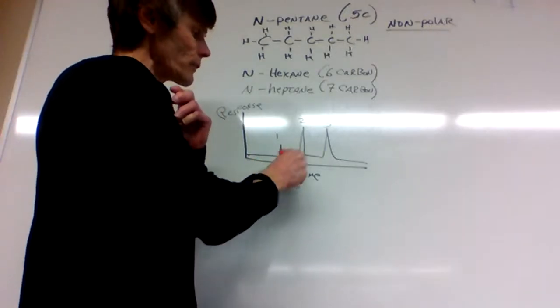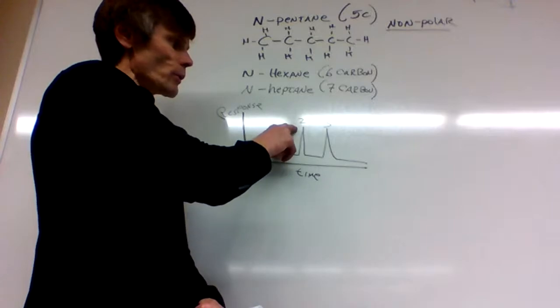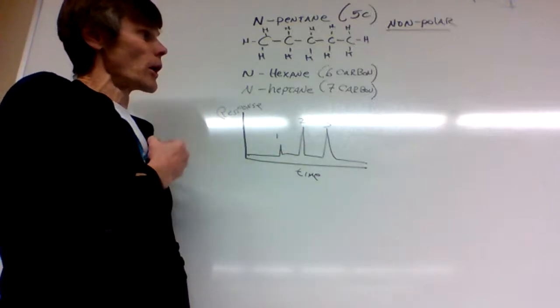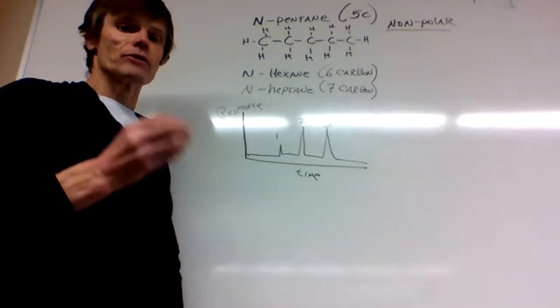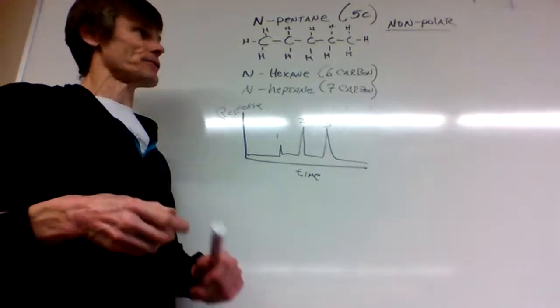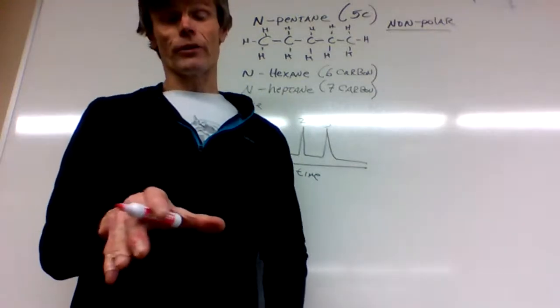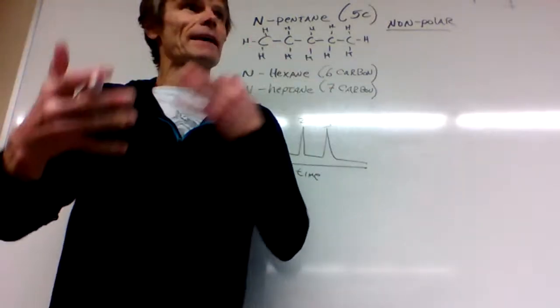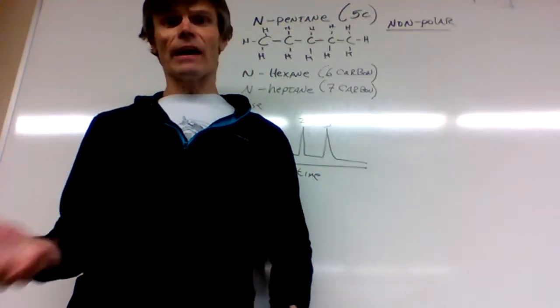Big question. Which one is related to which peak? Like, which one's sample 1, which one's 2, and which one's 3? Now, we have 3 hydrocarbons. The only thing that's different is their mass. Do you remember in Gen Chem, we talked a little bit about boiling points and mass? You can look these up also, so that's normally what people do. But if we were trying to think right then and there at that moment, which one do you think comes out first?